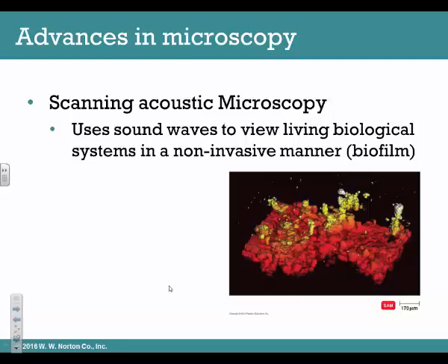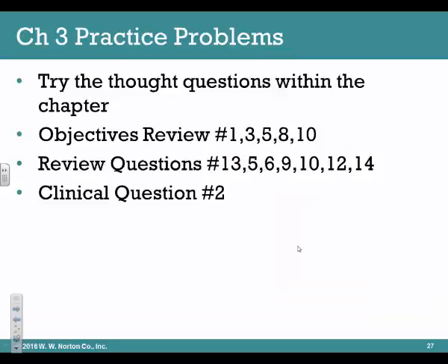This image is from a scanning acoustic microscope, and it shows the three-dimensional shape of the biofilm growth, in which these towers of many different types of bacteria form. And this is a living specimen. Sometimes when you kill the specimen or stain it, it can modify the actual appearance. So by studying living organisms, you're really seeing how it really looks.